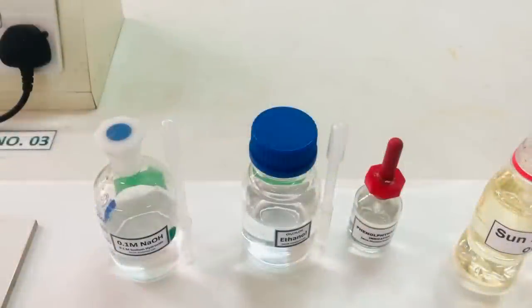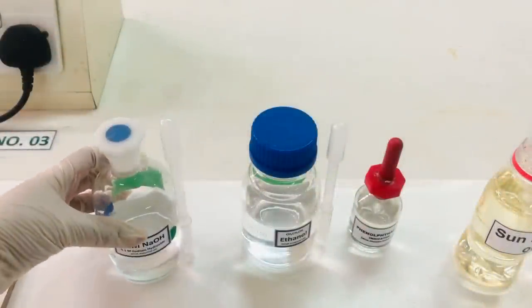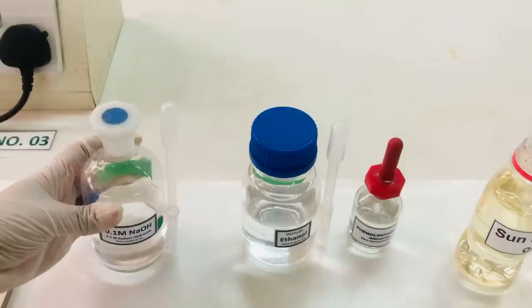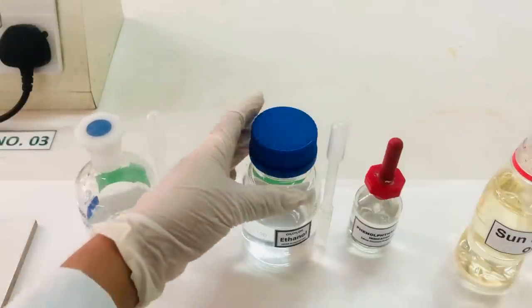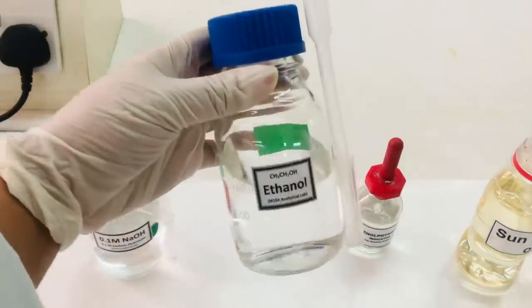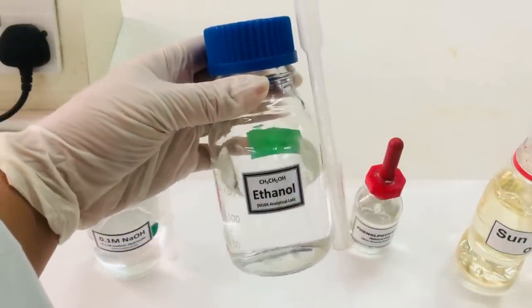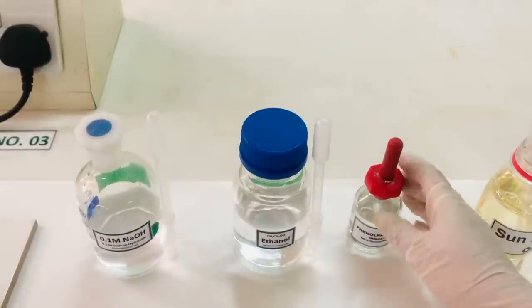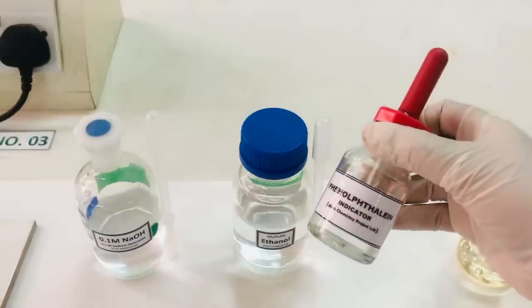In addition to this, we will be using a standardized solution of NaOH, a neutralized solvent, in this case it is ethanol, and phenolphthalein as an indicator.